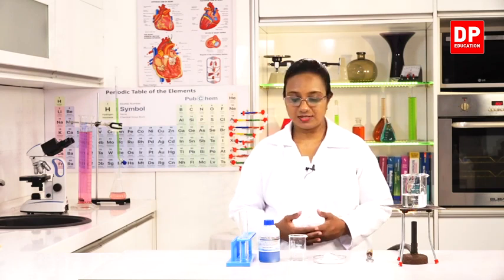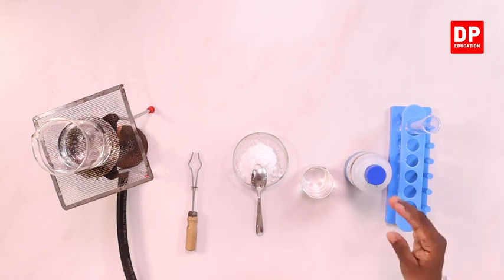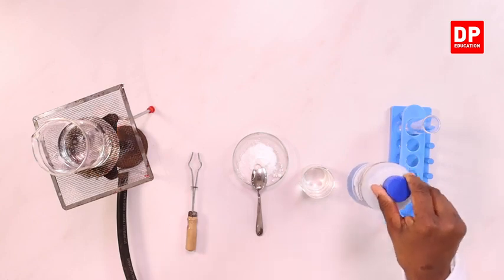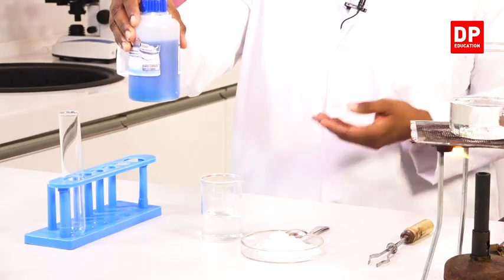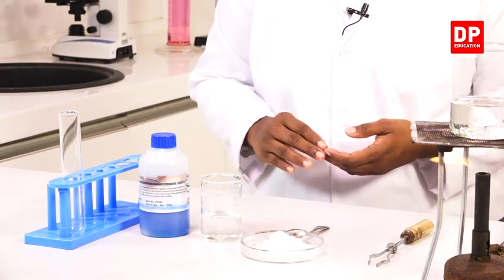Okay students, now we will do the activity to test the presence of glucose in food substances. For that, we will need glucose, and water to dissolve glucose. Then the reagent that we are going to use is Benedict solution. You can see it has a nice blue color, and that will give a color change with the glucose solution.